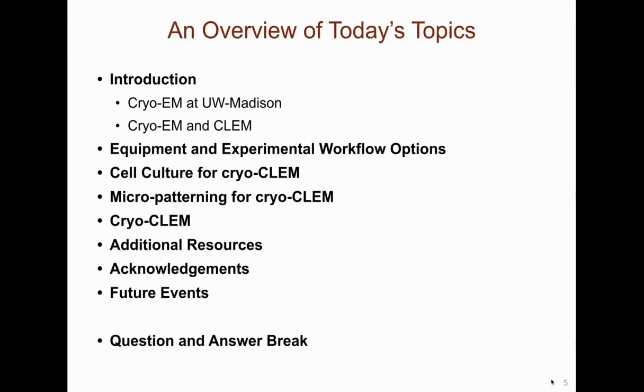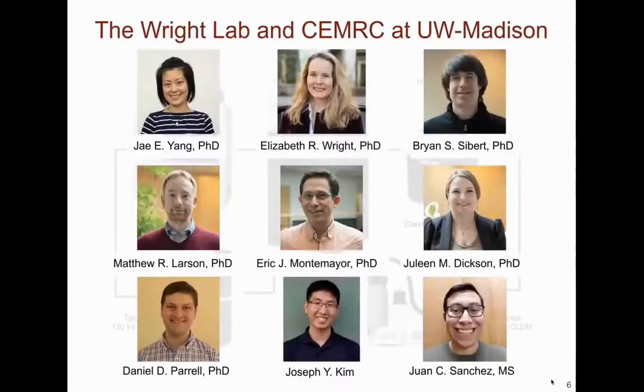At this point, I will move us into a practical discussion of micropatterning with the Alvéole PRIMO system and cryo-CLEM with the Leica EM cryo-CLEM. I will present some future areas for CLEM technology development. I will then provide a few suggestions about resources, make a few acknowledgements, and point to our future webinar events.